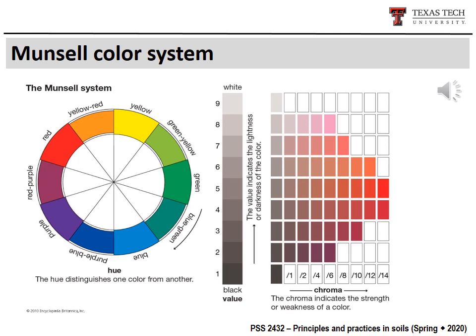Okay, let's understand a little bit more about the Munsell color system. Since you understand what hue means, or the Munsell codes, 5Y, 10R, 2.5YR, now each hue or each color will be separated from each other based on value and chroma.